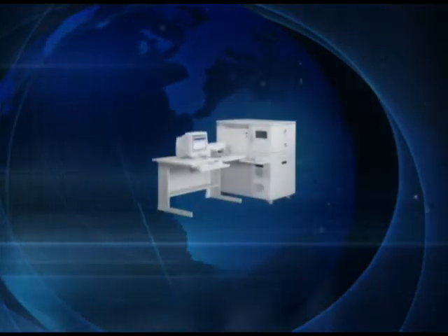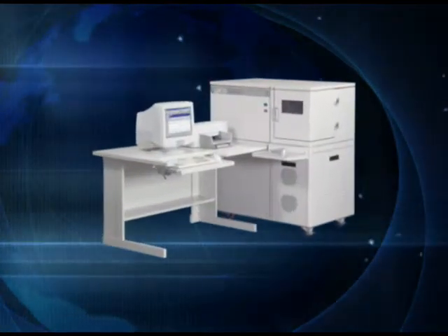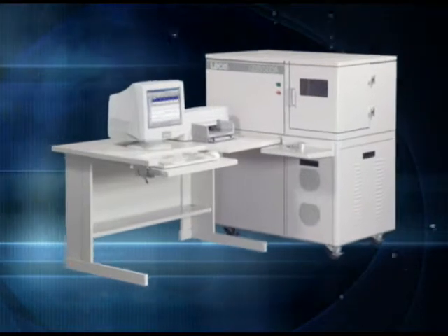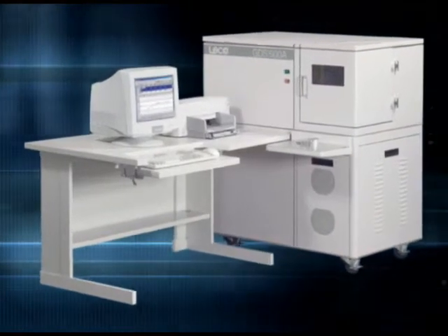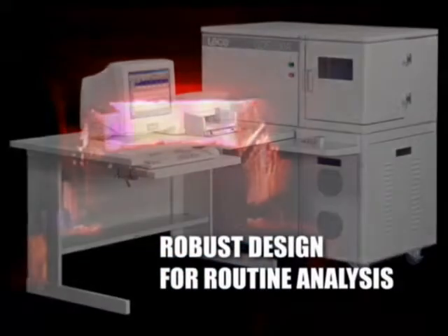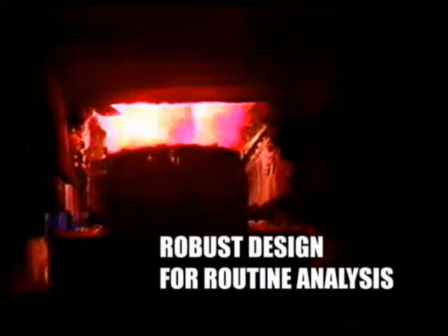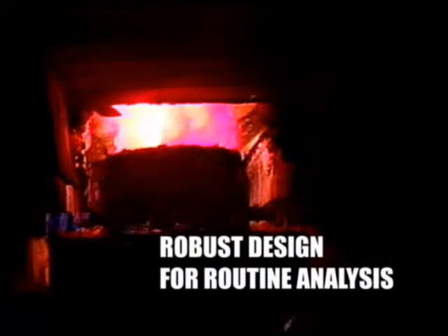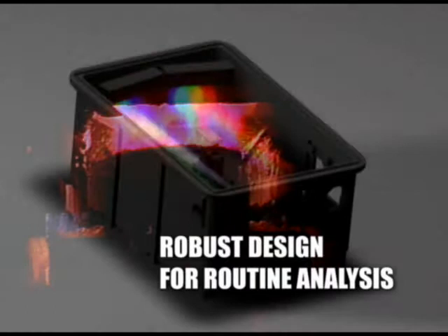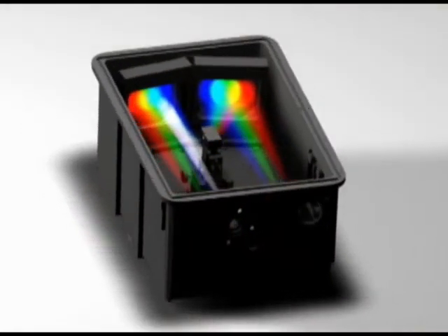The new Leco GDS500 glow discharge CCD spectrometer continues in this tradition. Designed for demanding laboratories where durability and a rugged design are important, the Leco GDS500 is a revolutionary new product which provides a cost-effective solution for any laboratory.